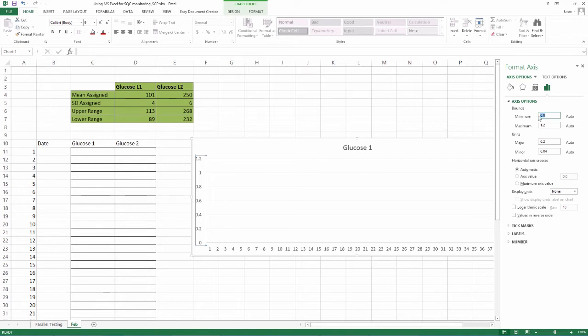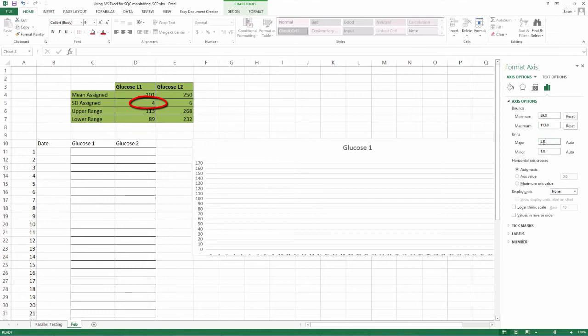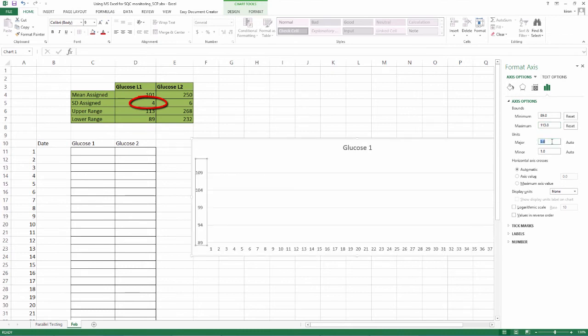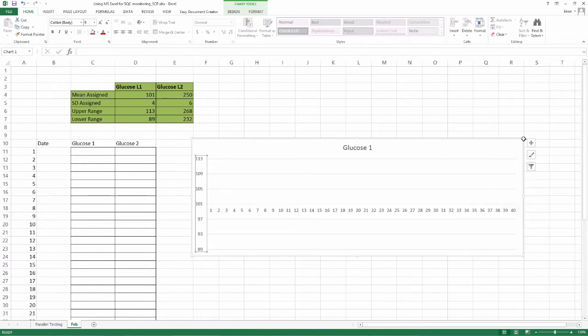Against minimum, you assign the lower range values. Against maximum, you assign upper range. Against major unit, you assign the SD value. Against axis value, you assign the mean value. Click close.